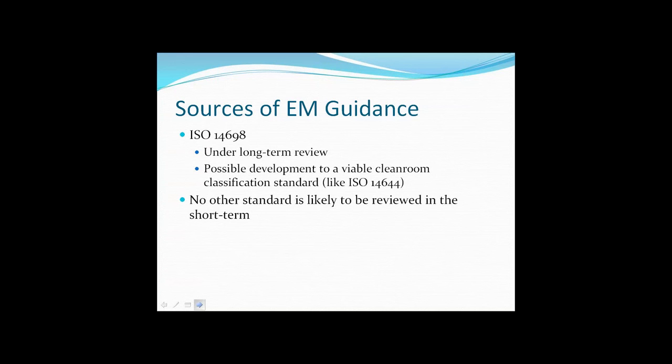So ISO 14698 is currently under revision, subject to review by an international committee. And one of the objectives of revising that standard is to possibly make it more similar to the non-viable particle monitoring standard, ISO 14644, and that is to come up with perhaps something to work as a viable classification standard for clean rooms, including an assessment of the condition of the areas at startup. And at present, a lot of the drivers for that change are coming from Europe.